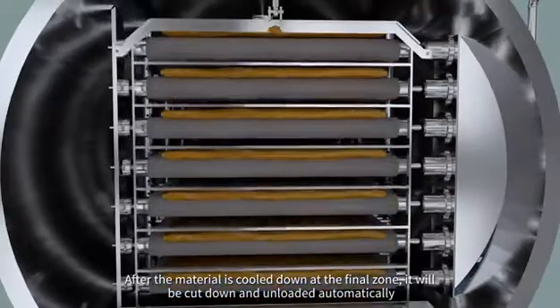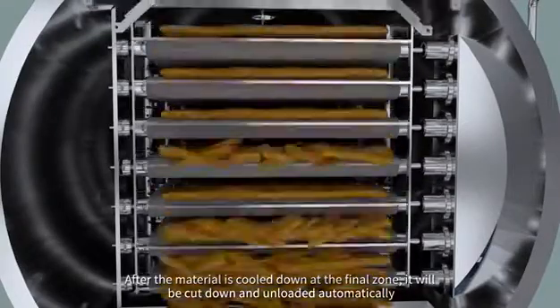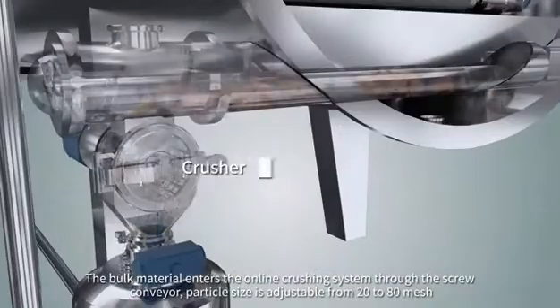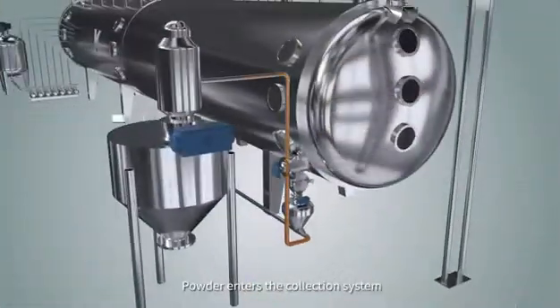After the material is cooled down at the final zone, it will be cut down and unloaded automatically. The bulk material enters the online crushing system through the screw conveyor. Particle size is adjustable from 20 to 80 mesh. The powder then enters the collection system.